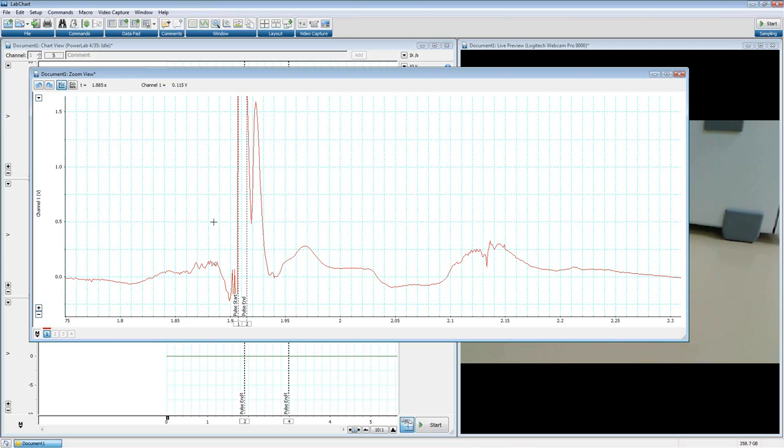It's basically a way to account for noise and not to constantly have a fast response output being triggered over and over again. So it allows you to put a little buffer in. Once we trigger, it has to go below the trigger threshold by a certain amount before it will trigger again. And that's all the hysteresis value does.